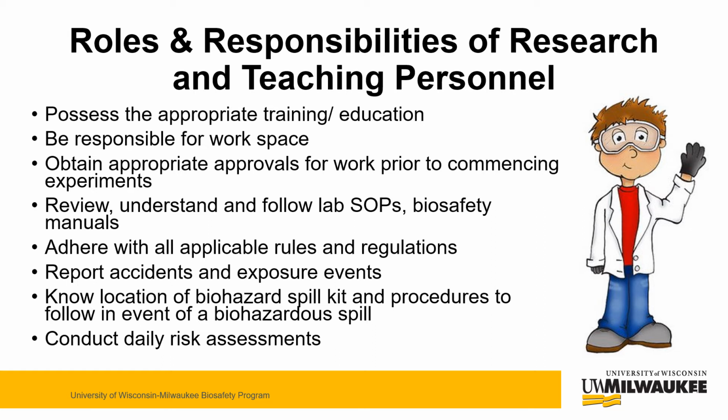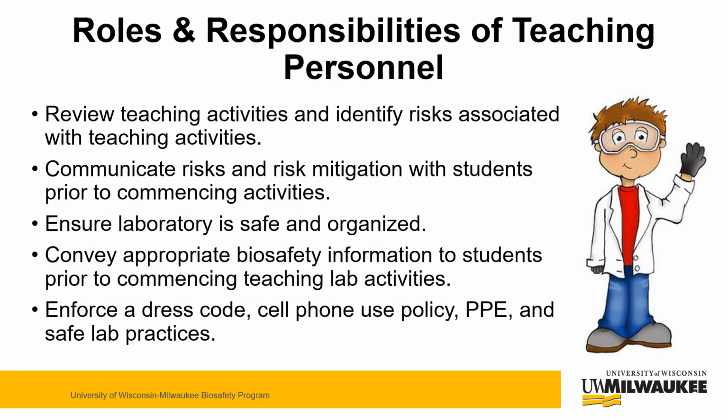You should know the location of your biohazardous spill kit and the standard operating procedure to follow in the event of a biohazardous spill. It is also your responsibility to conduct daily risk assessments prior to conducting experiments to reduce risk in the laboratory.